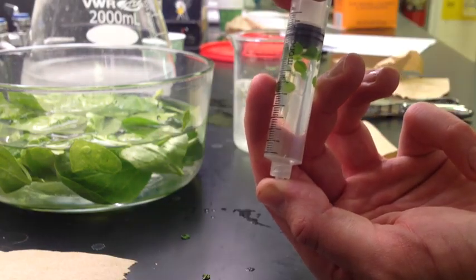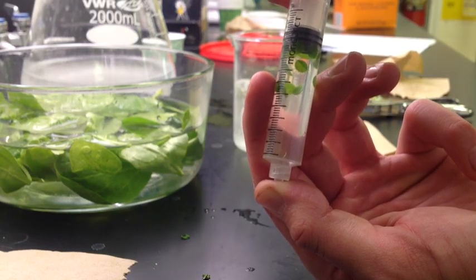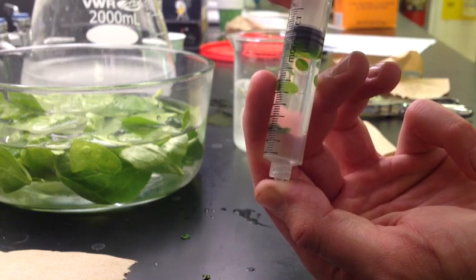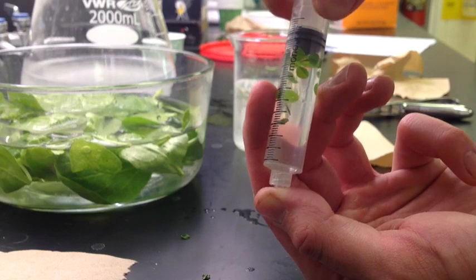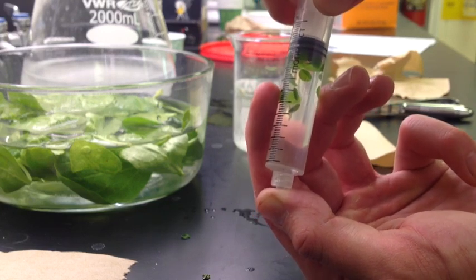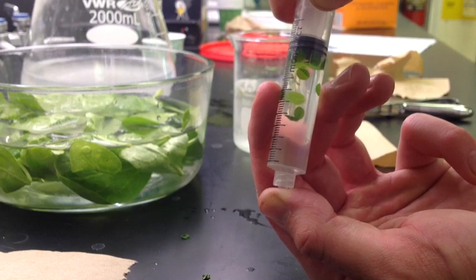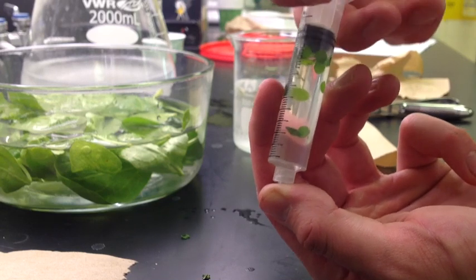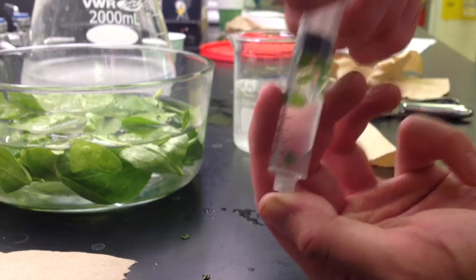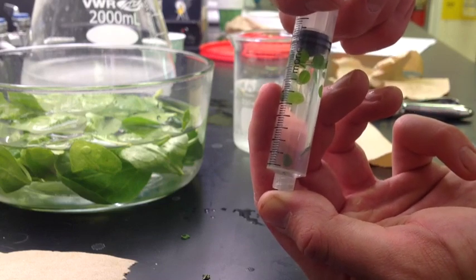The baking soda solution provides the carbon that the leaf discs need for their Calvin cycle in order to produce sugars. While producing these sugars in the Calvin cycle, the leaf discs will release oxygen, which is what will make them buoyant. The faster the leaf discs start to float again, the more active they are in the photosynthesis process.